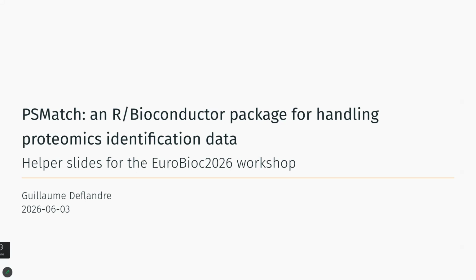As part of his research, he uses and develops packages that are focused on the identification of mass spectrometry data. And so that will be the topic of his workshop today. PSMatch is one of the packages, and he'll show, demonstrate, illustrate how to handle proteomics identification data with that.